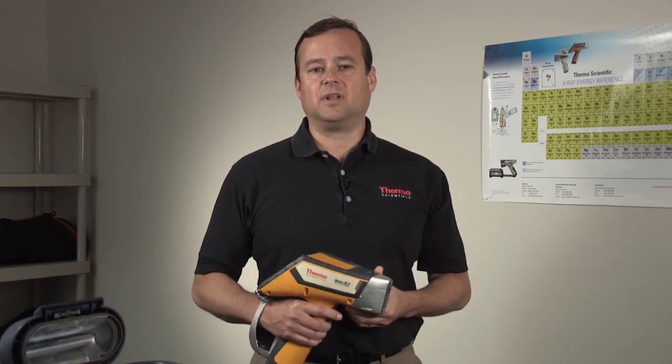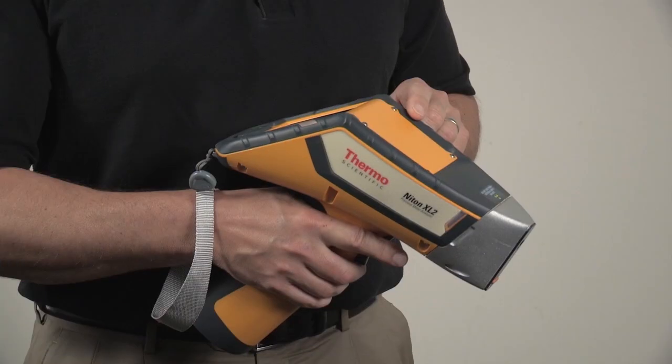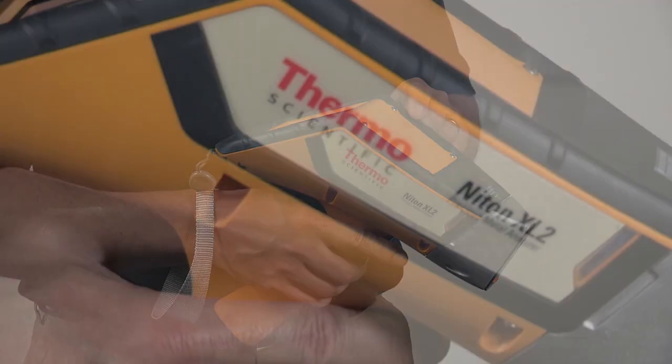Hi, this is Jeff Walker from Thermo Fisher Scientific, and I'm here to introduce you to Thermo Scientific Portable XRF Analyzers, specifically the Niton XL2 Precious Metal Analyzer.